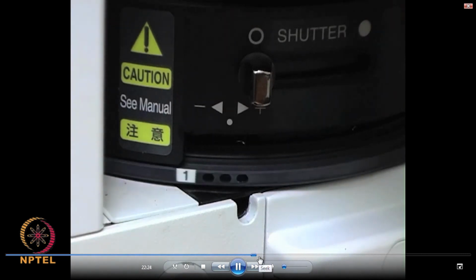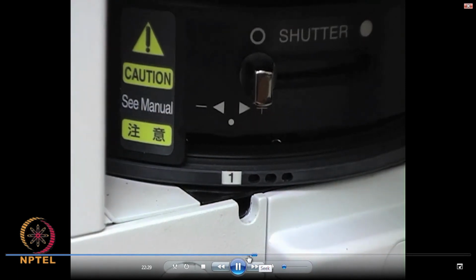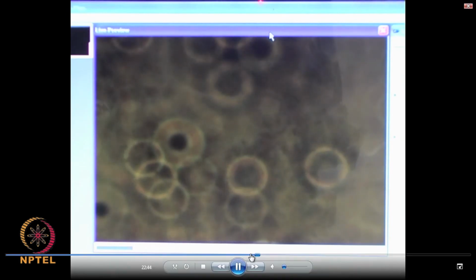Now we will change to phase contrast mode. That means you have to change the aperture, both on top as well as bottom, to the phase contrast aperture and filters. Let me go back.